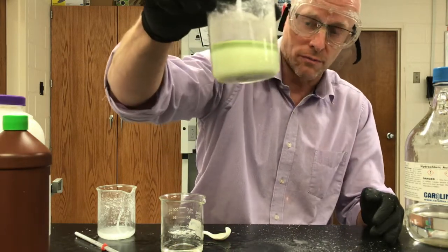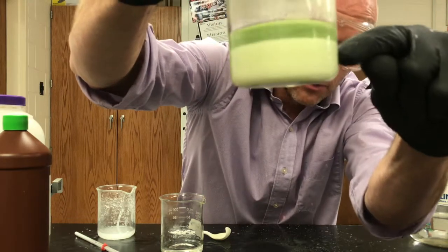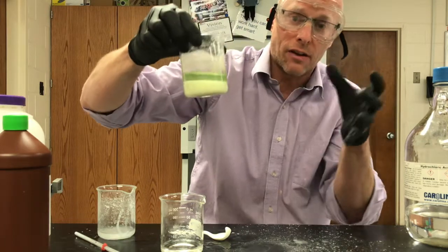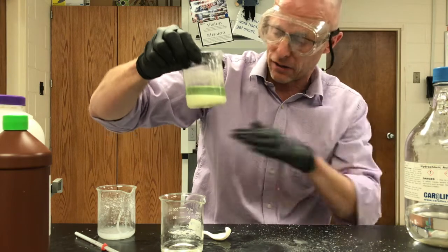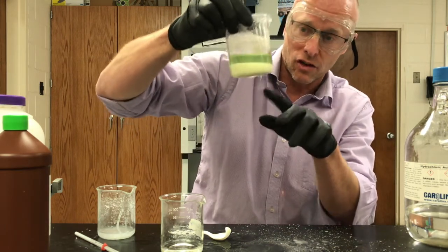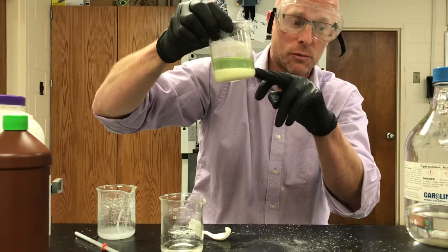That is my neutral solution. You can see the green at the top. All of this below here is salt. There is a huge amount of salt forming because I had a very strong concentrated solution of hydrochloric acid and a very strong sodium hydroxide solution — that's why we made so much salt. But green tells me it's neutral.